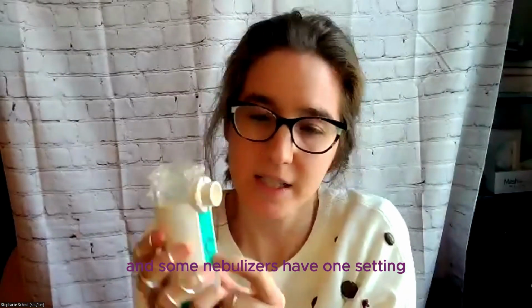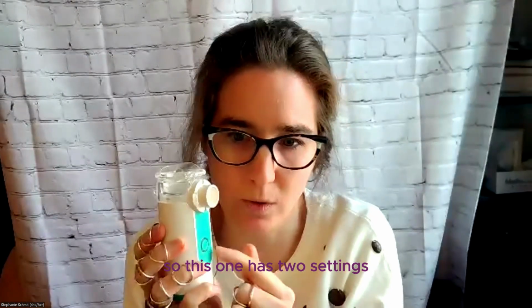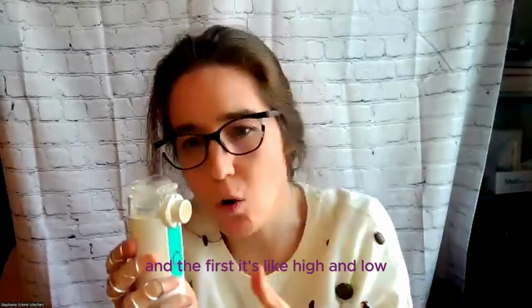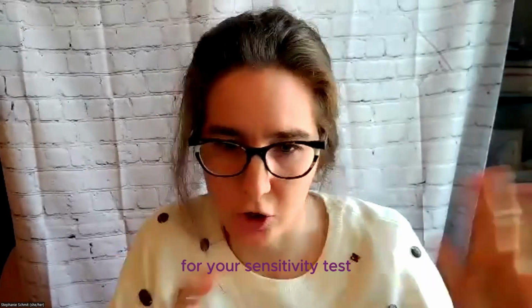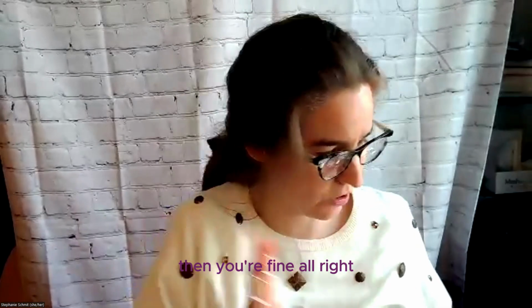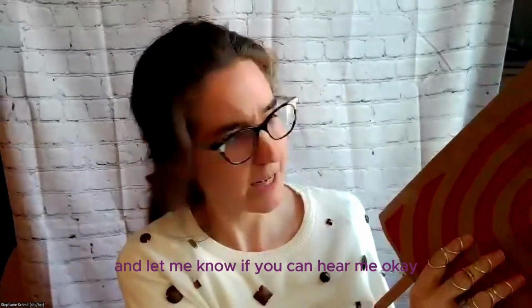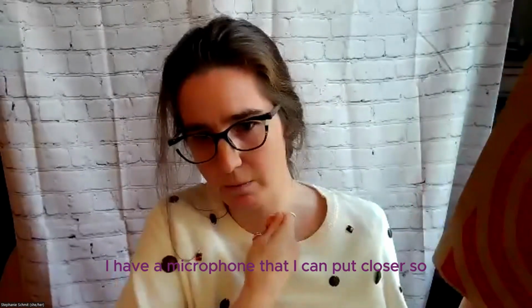This button is the button that you want to use. And some nebulizers have one setting, some nebulizers have two settings. So this one has two settings, like high and low. As long as you use the same one for your sensitivity test and for the mask fit test, then you're fine. All right, you're not going to be able to see me, and let me know if you can hear me, okay? I have a microphone that I can put closer.